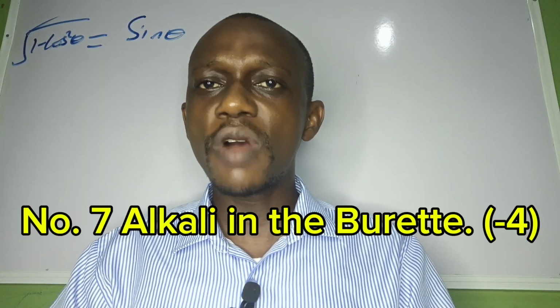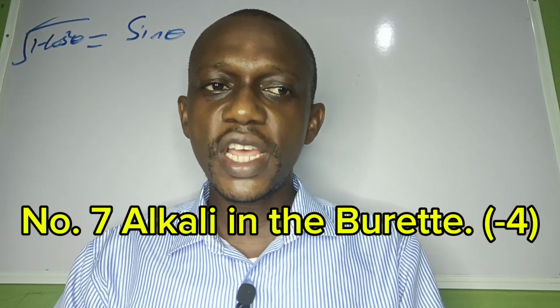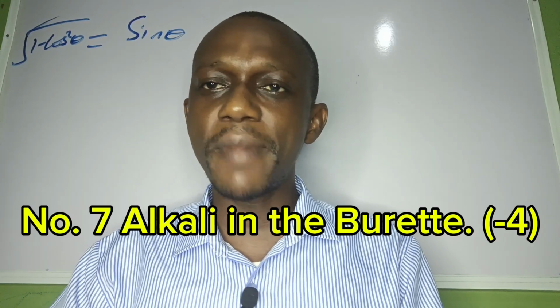Number 7, when you have your alkali in the burette, acid is supposed to be in the burette. So alkali in the burette attracts -4 marks.